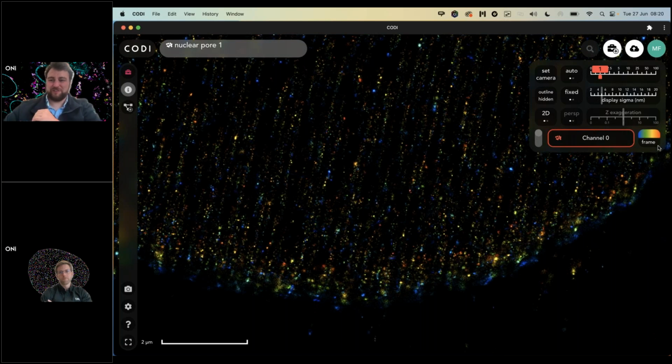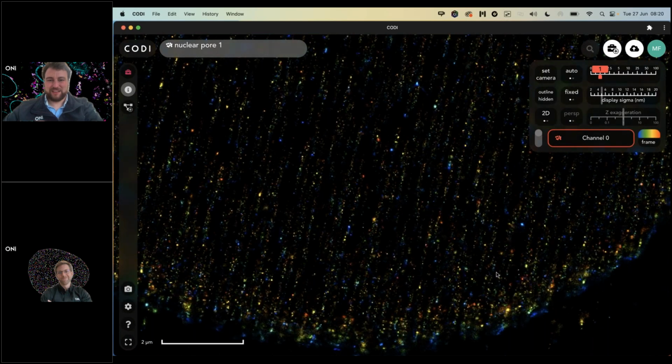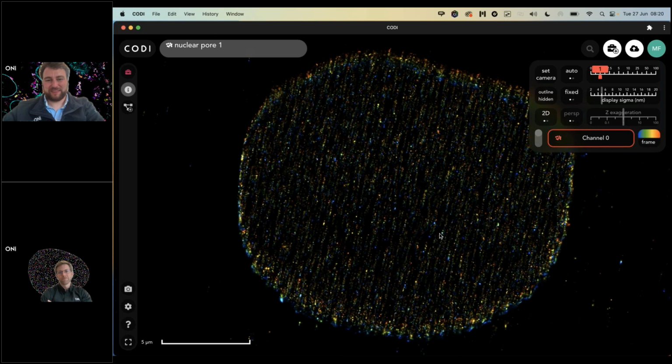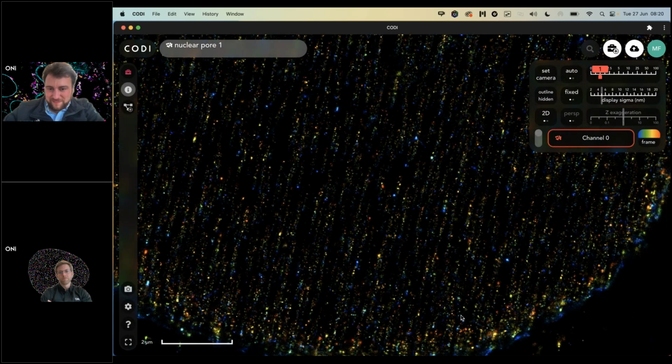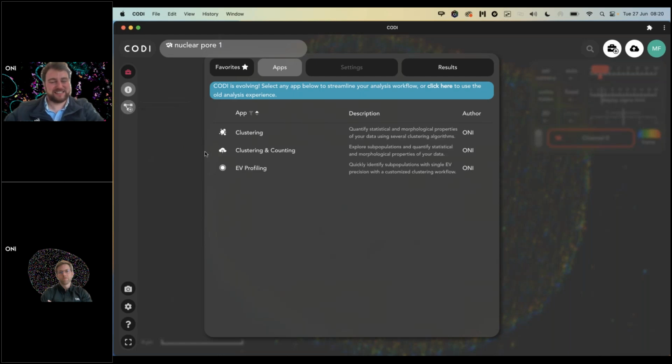And so the 15,000th frame is colored in red. And we can see it sort of making streaky rainbows across this data. So the first thing we probably want to do is run drift correction. This streak may have come from thermal expansion, or maybe just something sliding on the cover slip. We'll see in a second just how many nanometers it slid.